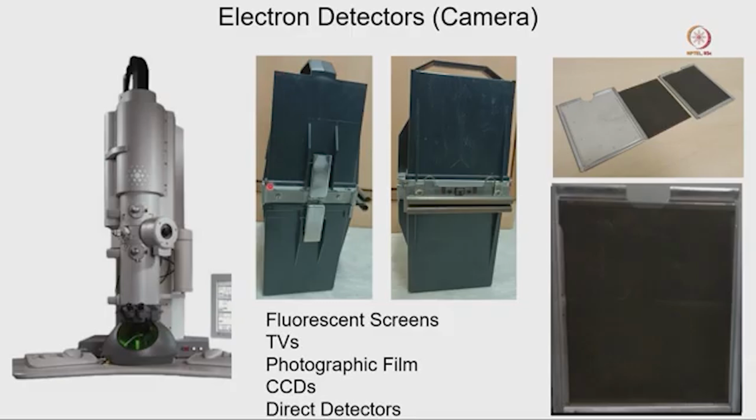So, a total of 56 films you can stack here, and this entire 56-film cassette goes at the back, inside the microscope. This plate camera we can fit at the bottom here, and then this is the handle, which will bring the entire plate out here, and it will go through the exposure and be stored at the bottom. When the entire film is stored at the bottom, we have to take these out, go to the dark room and develop the film.